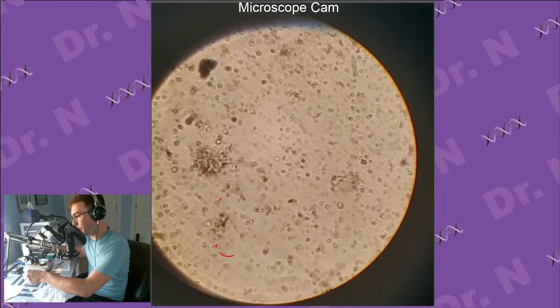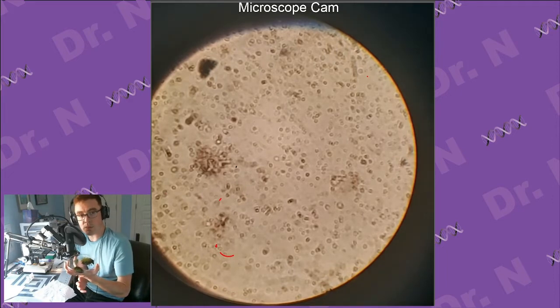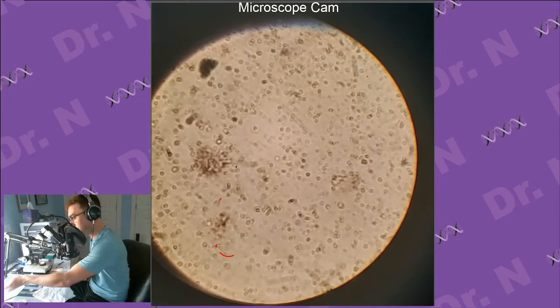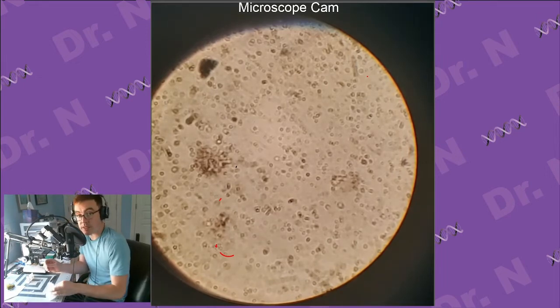The other option is I have this nice little plate of goodies that I got this morning. So I have two mosses and some lichen. I don't know what we'd see, but I wanted to wash them off, take off whatever comes off, and see if we see any little critters swimming around inside. So why don't I do that first? That's much easier, because there's definitely stuff living in there.